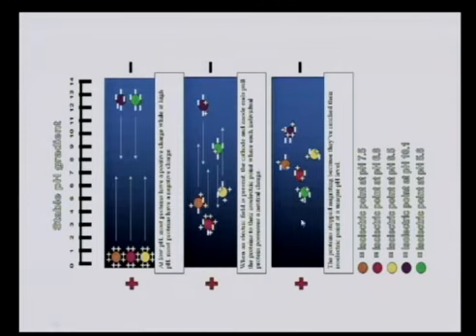In the third image, you can see all these ions are now separated. Especially the green one, which came from the high pH side in the first picture, has now moved to here.